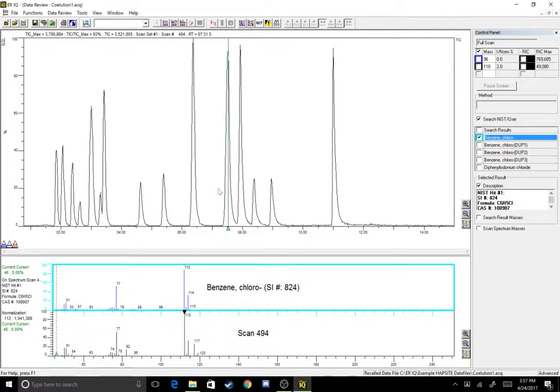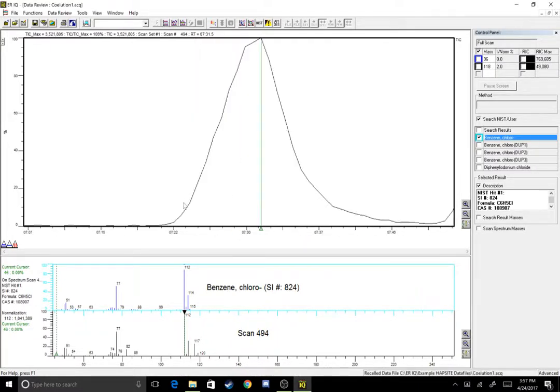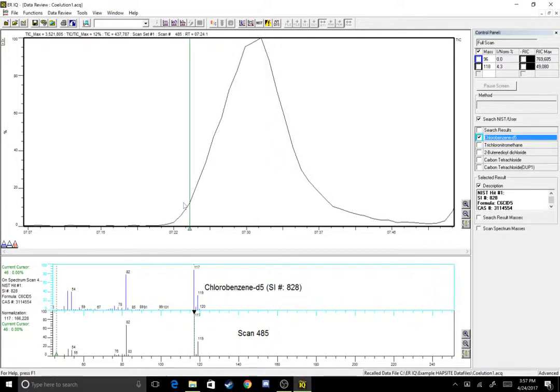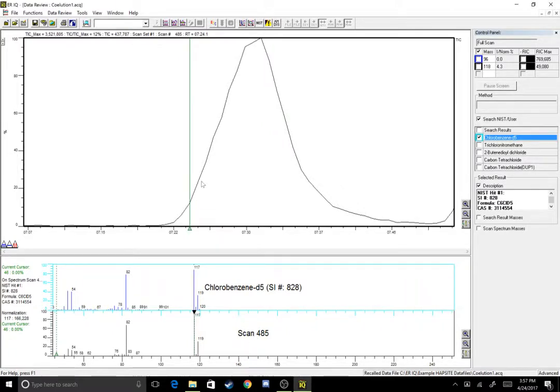So I'm going to zoom in on this peak at about seven and a half minutes. Zooming in there. The first thing I always like to do is something called walking the peaks. That's essentially taking your scan selector from the left side of that peak all the way to the right side of that peak and you're trying to look for changes in mass fragments in your scan. So let's go ahead and do that.